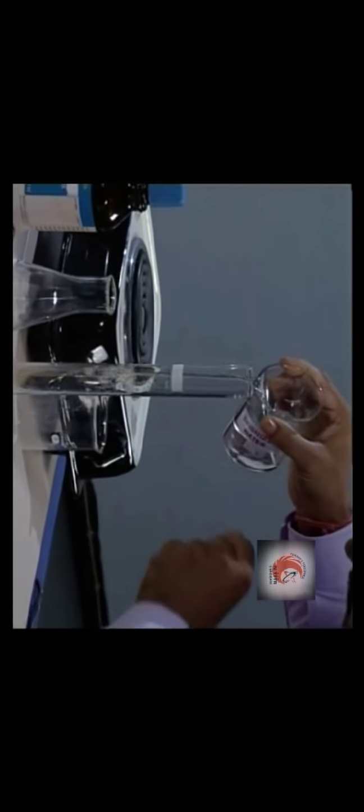To make up for the same, we will add distilled water. Transfer it in conical flask.